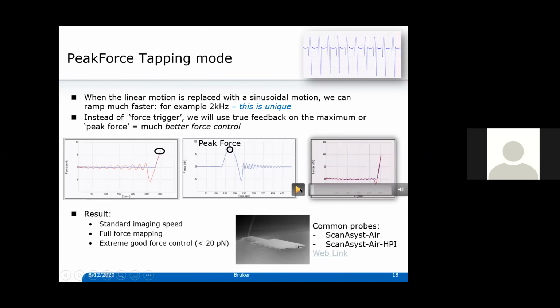There, and then we have an area that's harder, much less adhesion, much stiffer slope. And I have a nice curve. The tip is approaching, deflecting up, there's a little adhesion, and it comes back again. And so the way it works is I tell it how much force I want. In this case, whoever did this was doing this at 10 nanonewtons, and it feeds back on that. So I can type 10 nanonewtons into my feedback if I have a spring constant that's calibrated.